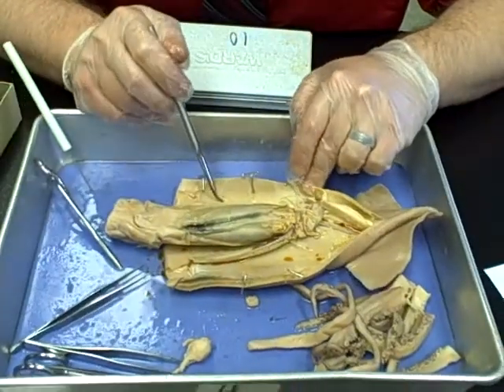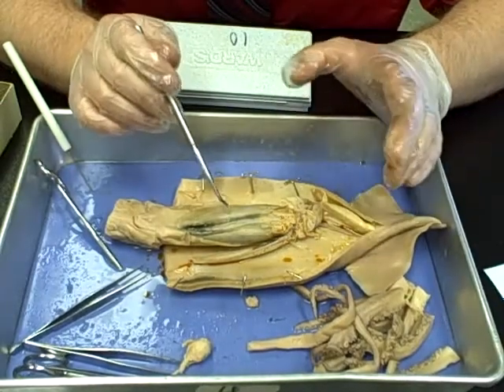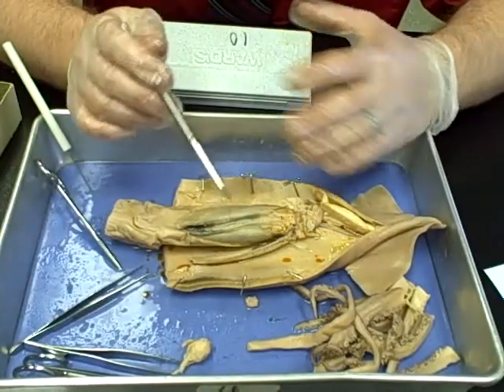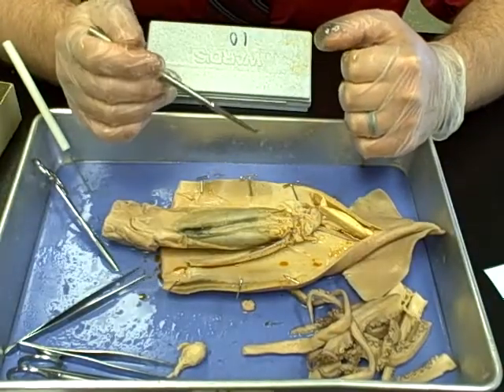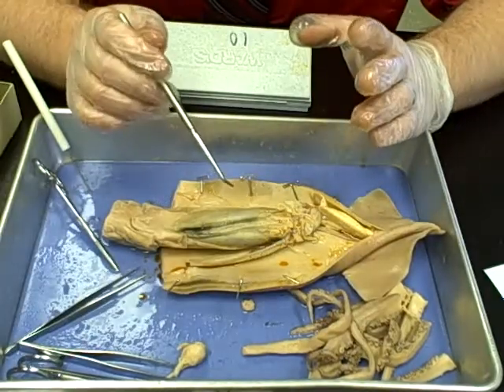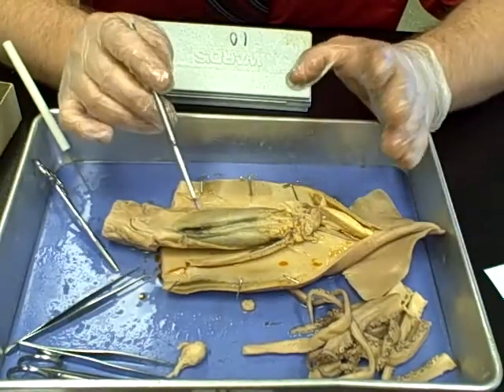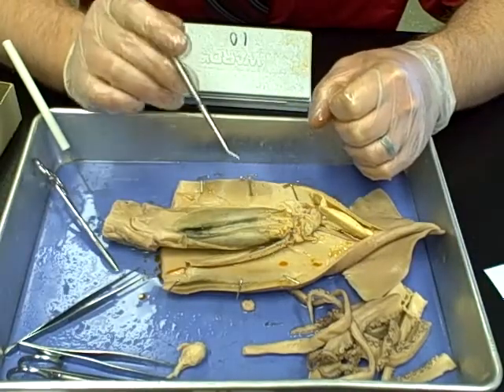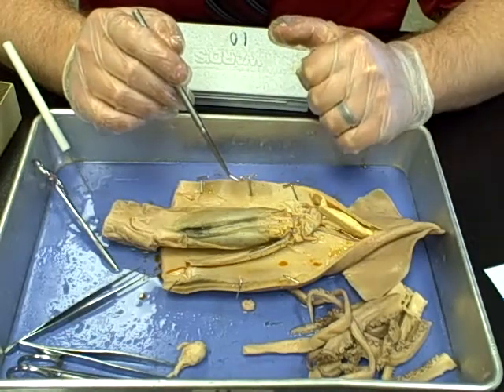If you can identify those major organ structures, that's what I'm looking for when I come around. I hope this video was helpful. Make sure you understand the general squid anatomy well enough to follow your dissection guide tomorrow and identify all the major structures we talked about. Take a minute to answer the questions linked at the end of this video, and I'll see you tomorrow for the squid dissection.